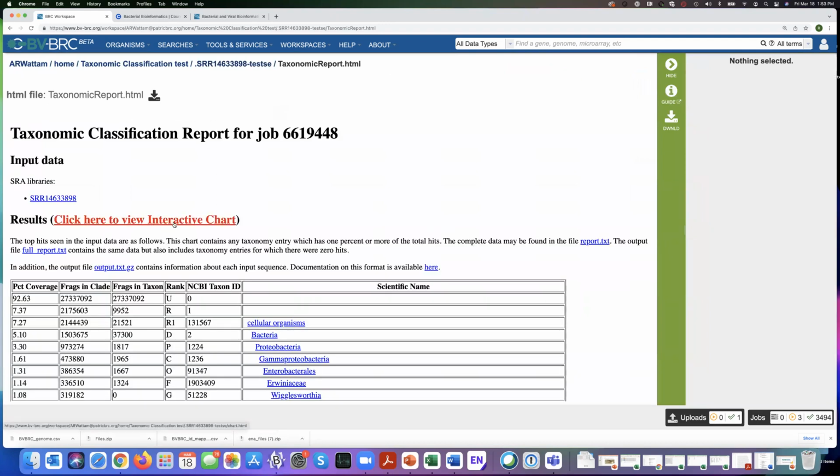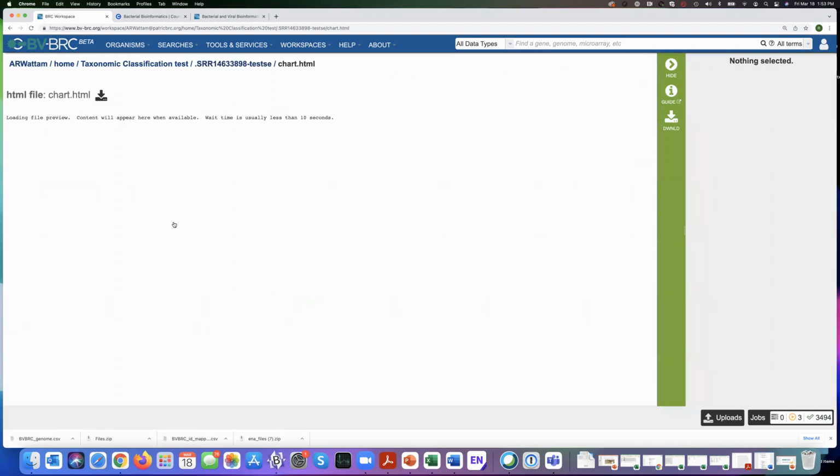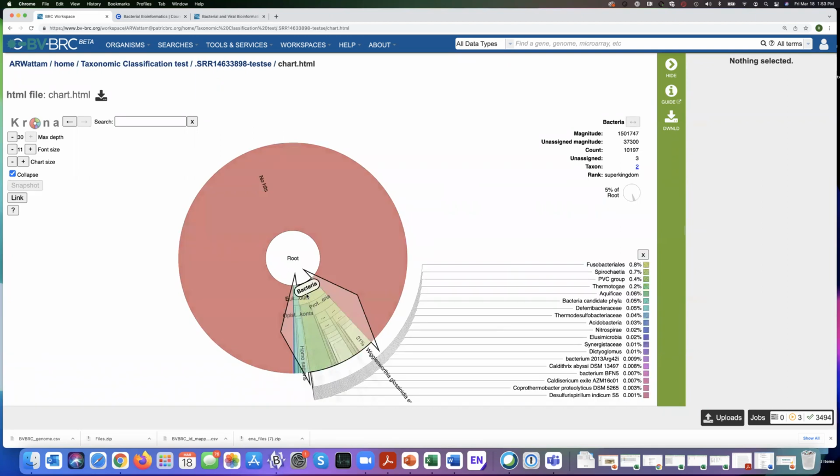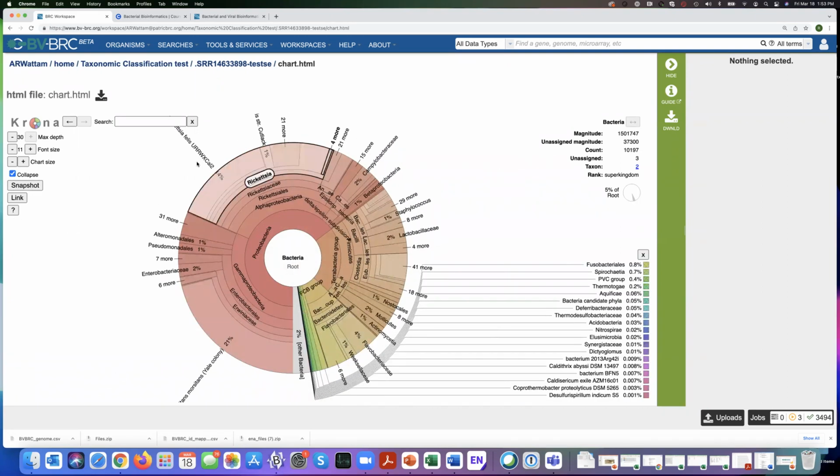So when you look at this, I want the genomes that are in this. This file is too big. Now see, it says no hits, because this is a squished fly, and that's what most of those reads are. But if you click on the bacteria, you can see that there's Rickettsia and there's this guy, which is Wigglesworthia, which is what I really want.